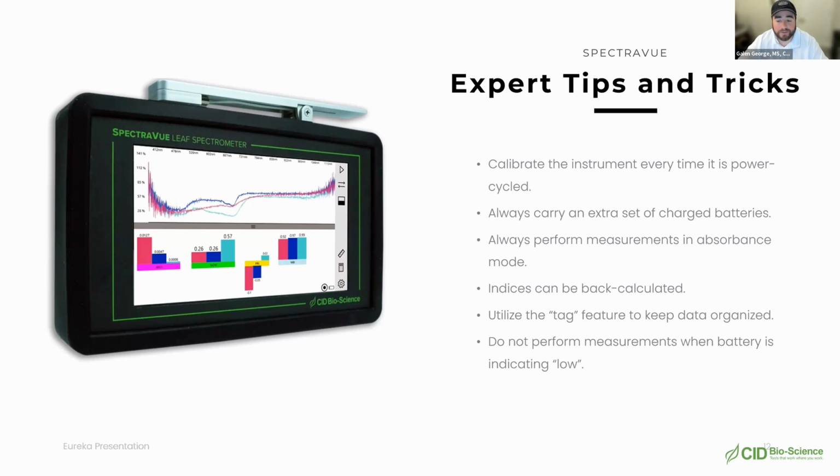So you don't have to do all that manual work afterwards. If you forget to load some indices, just make sure you load them before you export the data. Which is a really nice feature. For those of us with forgetful minds, it can be a really helpful feature.